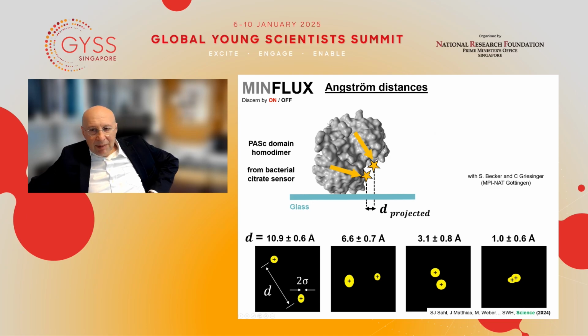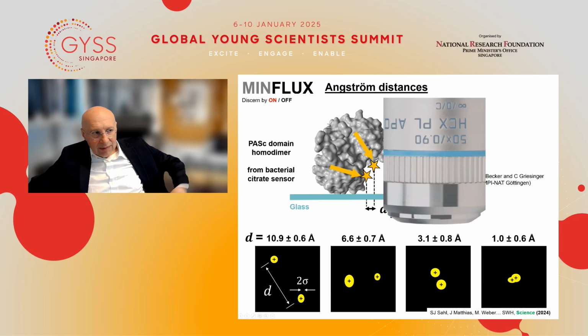So basically, the message here is we're down to nothing. Resolution has become so good in super resolution fluorescence microscopy that you really are down to basically fluorophores touching each other. Has this been expected? Well, you can say yes and no. When I started in the field back in the early 90s, of course, I had high hopes.